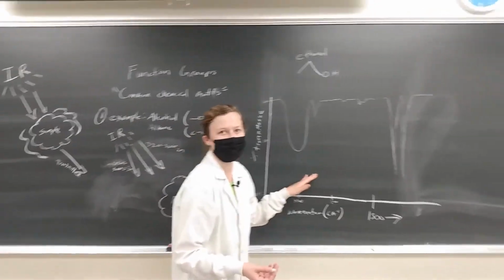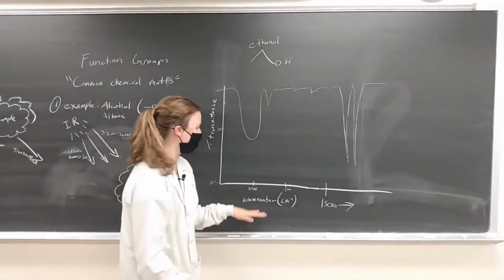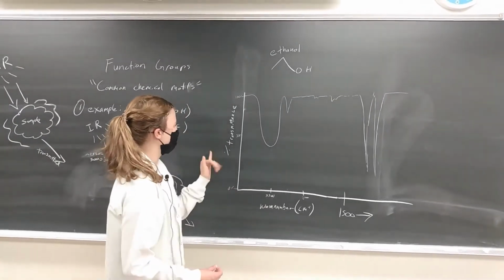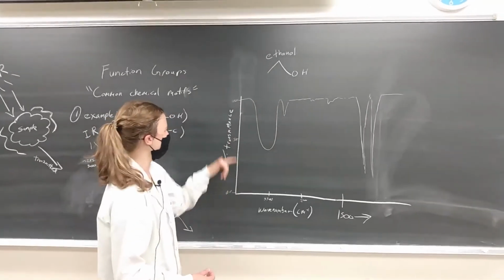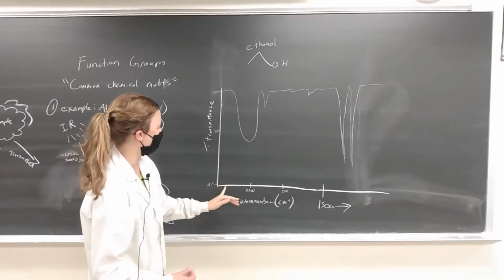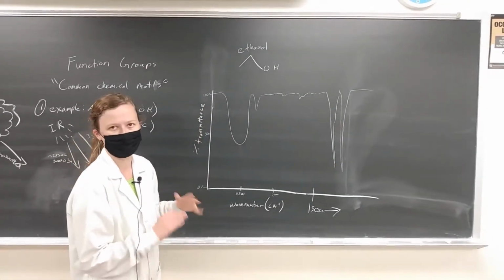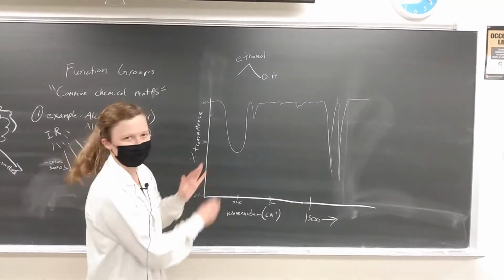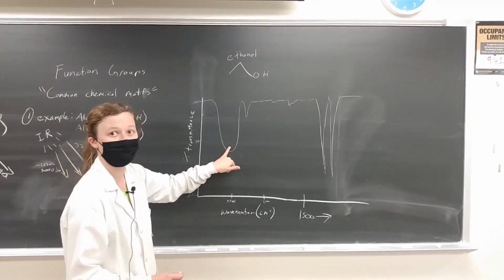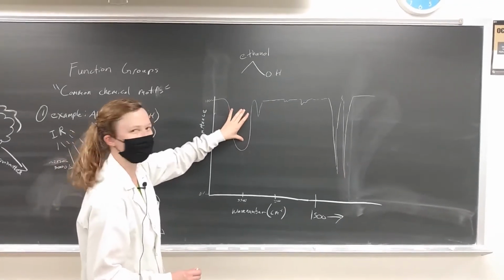And then the way we see this on an IR spectrum is on a graph just like this. So on the x-axis, we have wave number. The wave number is just the measurement of the energy or the wavelength of light that we're hitting the sample with. And then on the y-axis, we have percent transmittance. So all the way from 0, 50, all the way up to 100% transmittance. So if you have a point on here, a certain wavelength where you're at 100% transmittance, that just means your IR radiation isn't interacting at all with your molecule. Okay? It's just passing right through, molecule doesn't care. But when it starts to dip down and your percent transmittance gets really low, that means that all of this light is now being absorbed. And certain functional groups, as we know, like certain amounts of light.